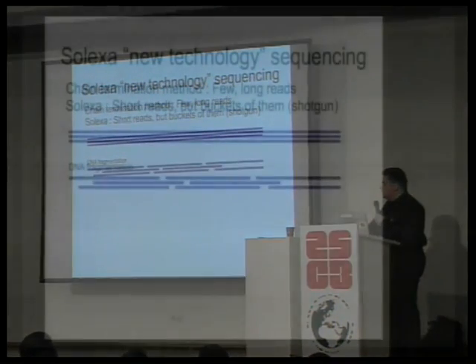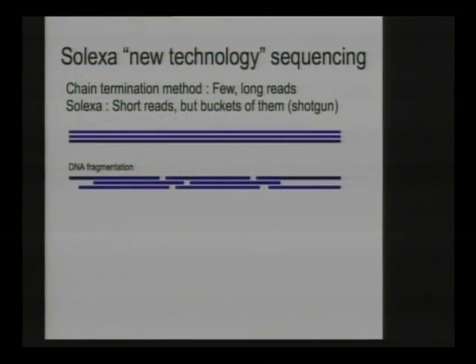So what they do is they take DNA raw material, and they fragment it to a certain size. So let's say 200, 300, 400 bases. So they just chop it apart in some nebulization process. I don't even know what they do exactly, but this is what they end up with. So this is the original DNA fragmented to fragments of roughly the same size.